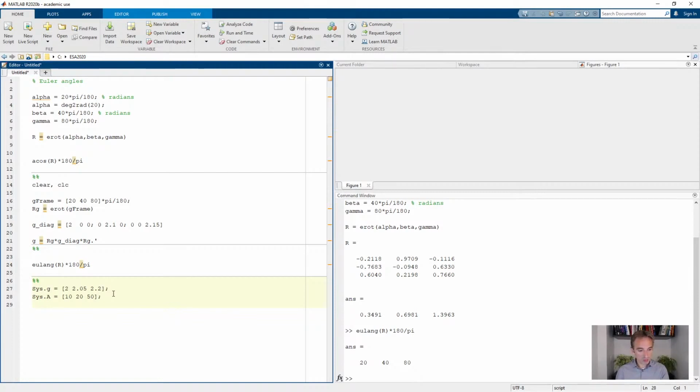Now you could specify a tilt for, let's say, the A tensor. You would write A frame and then give some numbers here, and I'm just going to put in some random numbers. Okay, this will tell EasySpin that the hyperfine tensor coupling is actually rotated by the second Euler angle of a value of pi thirds relative to the molecular reference frame.